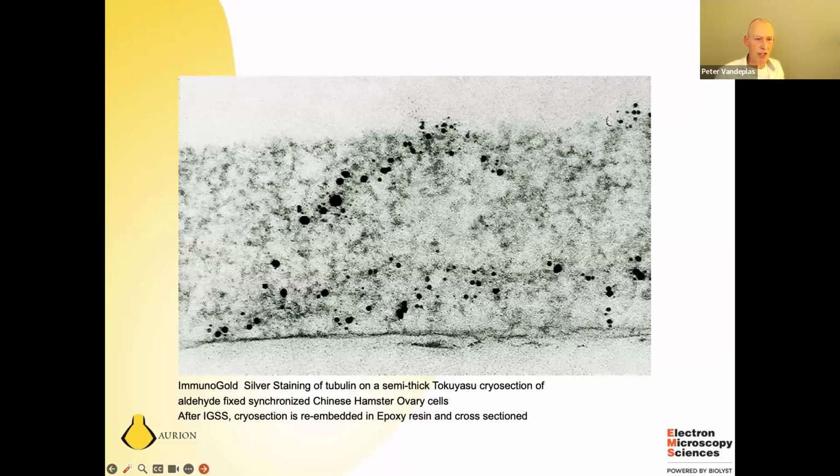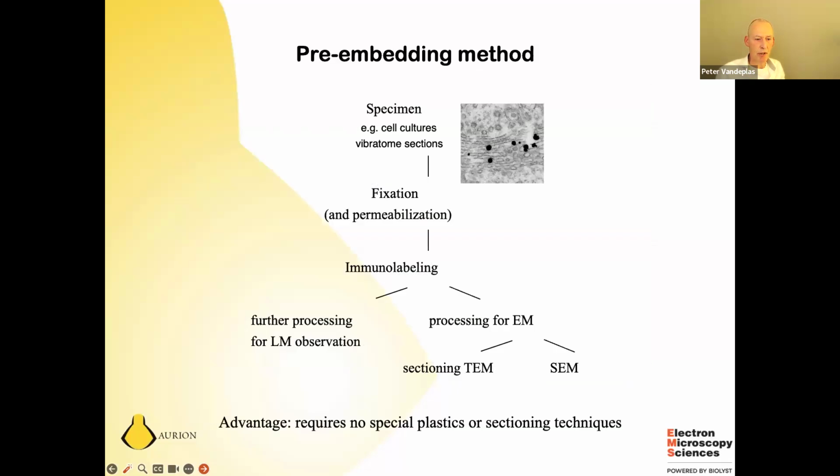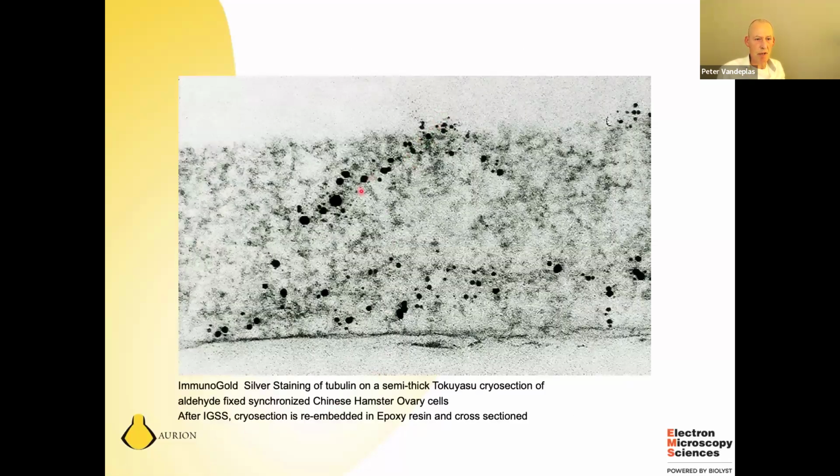And yes, these small conjugates have the benefit that they are very well able to penetrate into hydrated specimens. Here, this example of these Tokuyasu cryosections, now labeled with the polyclonal antibody and detected with goat anti-rabbit ultra small gold and silver enhancement. So not only labeling on top of the section, but also in the central part of the section. So labeling on top, but also the tubulin within the section is being labeled.